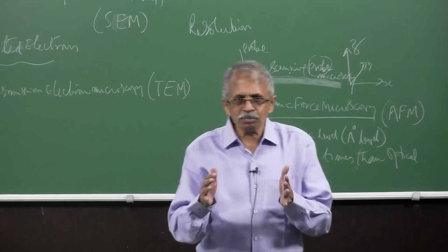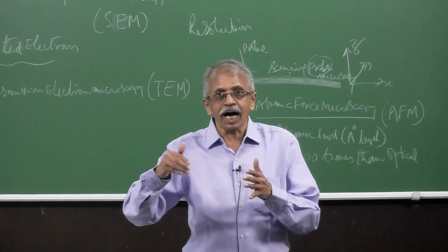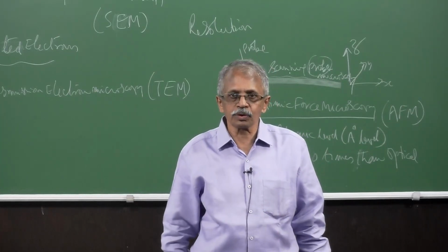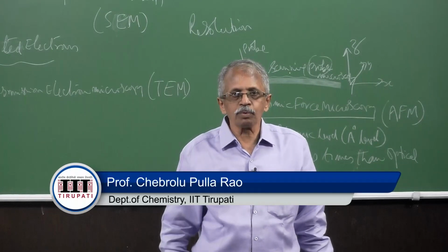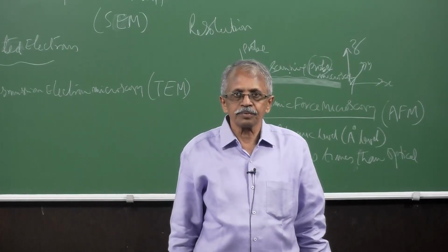So I think we have covered the fundamentals, the introduction and the basics of the AFM, and we'll keep moving across this particular course to AFM examples, then TEM, then SEM, with the principles and the examples as well, in that manner. So thank you very much.